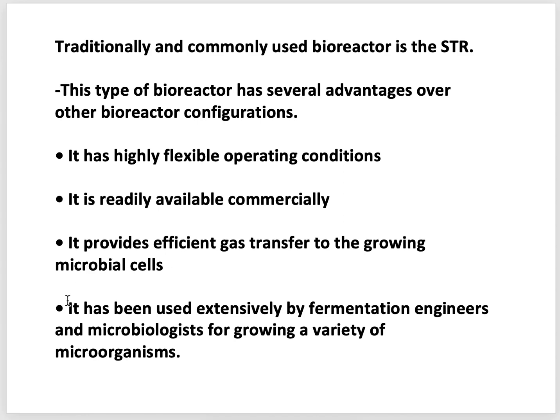And finally, it has been used extensively by fermentation engineers and microbiologists for growing a variety of microorganisms. So as it is extensively used, people have a better idea about this kind of fermenter. That means we have better knowledge about this kind of fermenter. So these were some advantages of stirred tank bioreactors over other types of bioreactors.